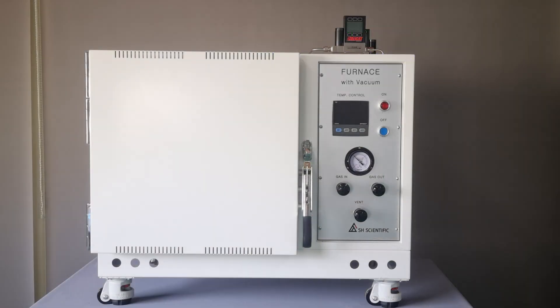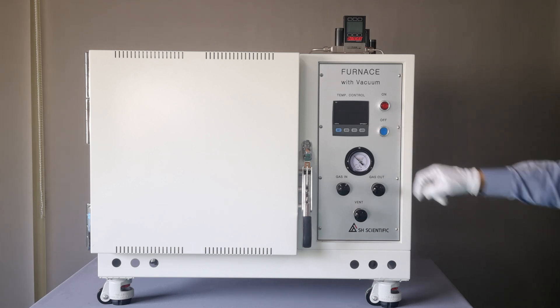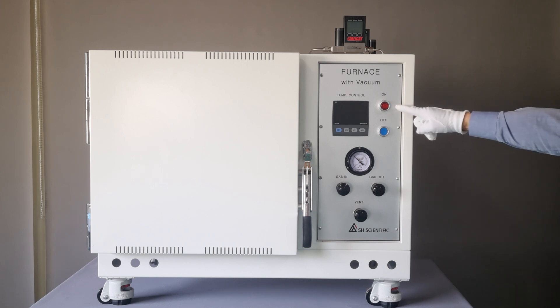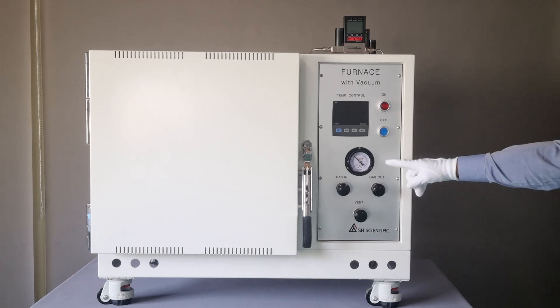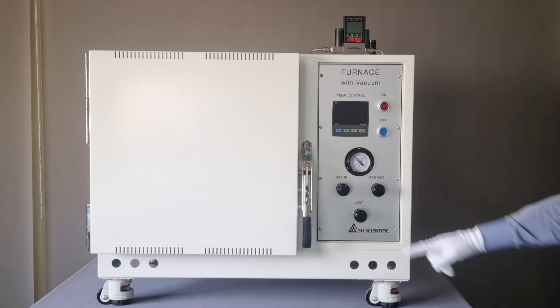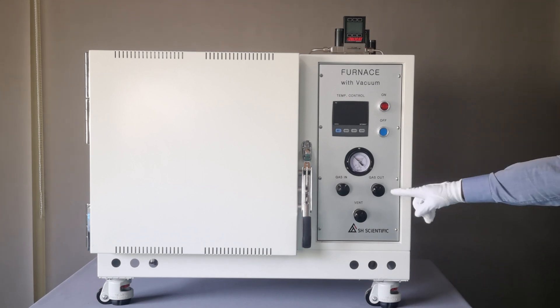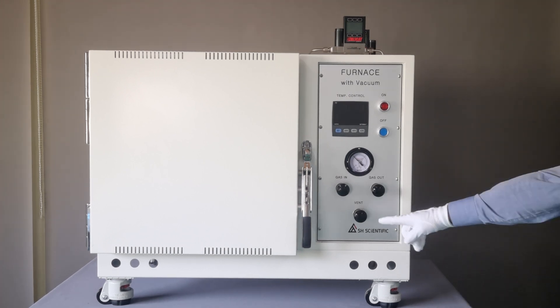Today we are going to show the SH-FU-10-MGV, which has a 30-step programmable controller, an on-off button for the heater, a vacuum and pressure display gauge, gas intake and outlet ports, and a vent valve.